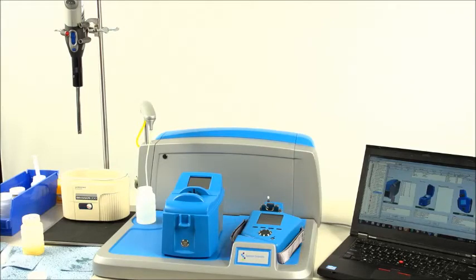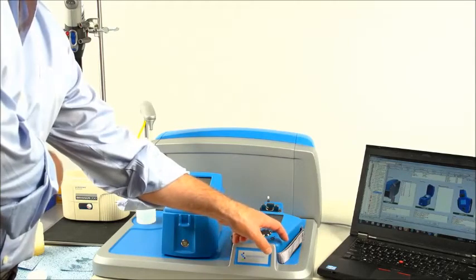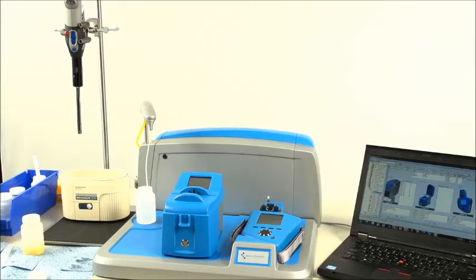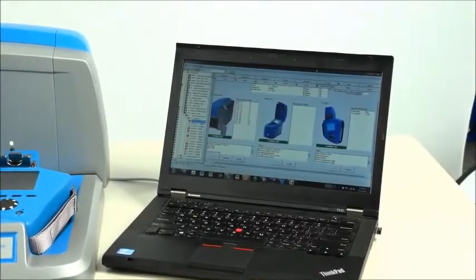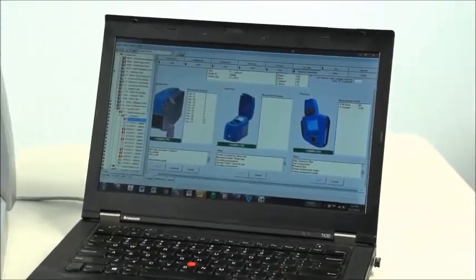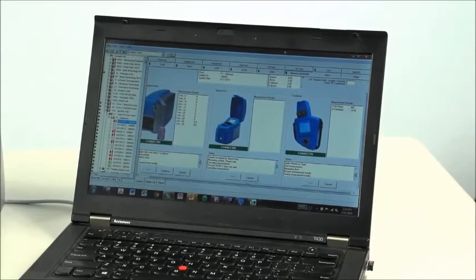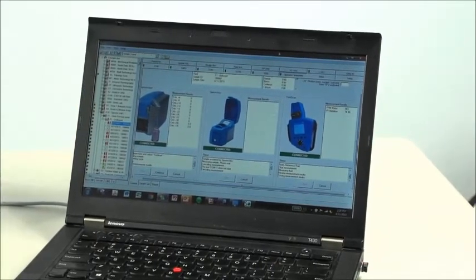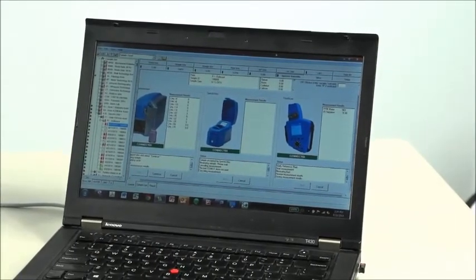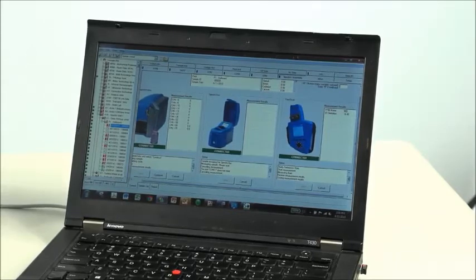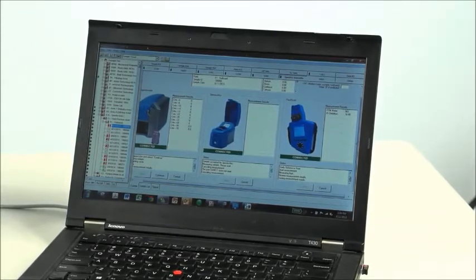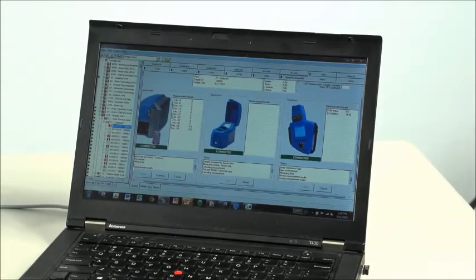Simply select Continue from the screen. Once the results are complete, select Save, and it will transfer data into AMS. The data from the three instruments are now recorded into the AMS Machine Health Manager Oil View LIMS database. From the database, one can look at sample results.